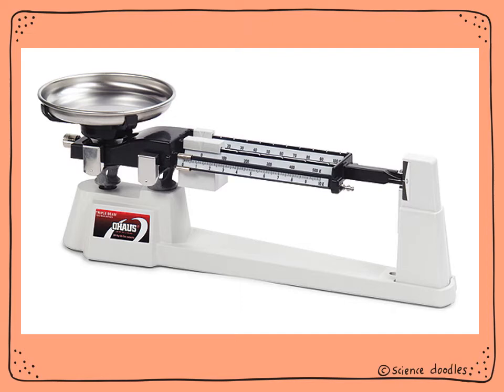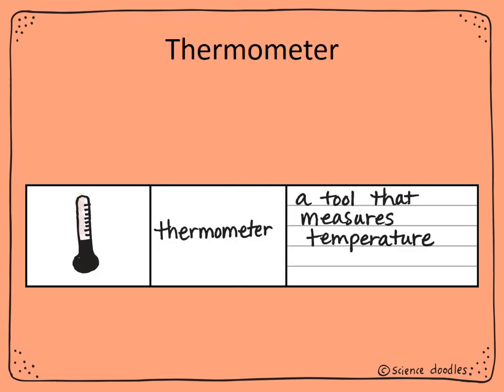And so here's an example of a triple beam balance. As you can see, it has the 3 bars, and the sliders are all the way to the left. And then if you look on the right hand side, the line of the arm is lined up with the 0 on the side.